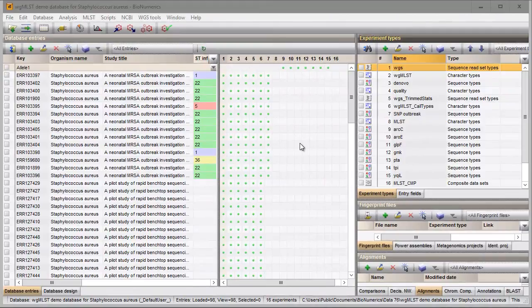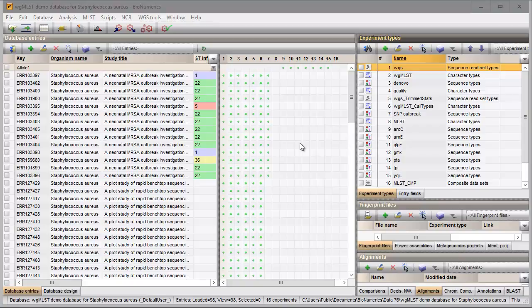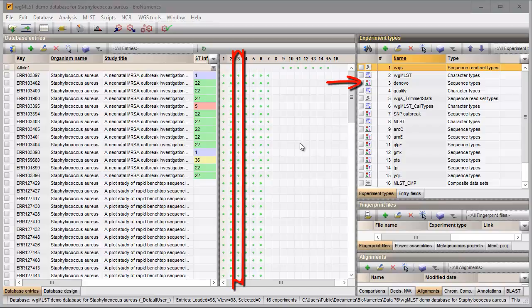In this video I will demonstrate how to extract subsequences from whole genome sequences. The different steps will be illustrated using this demonstration database containing 97 sequence read sets of Staphylococcus aureus with calculated de novo assemblies. The whole genome sequences are stored in the sequence type de novo.